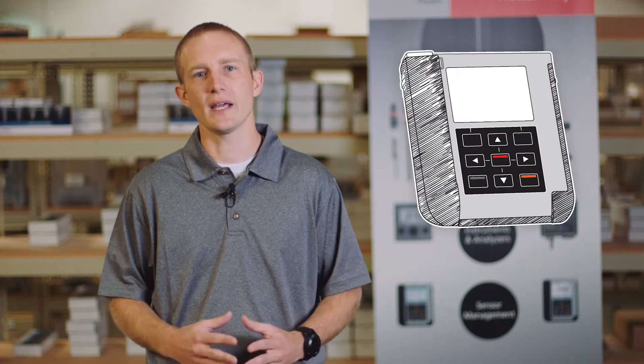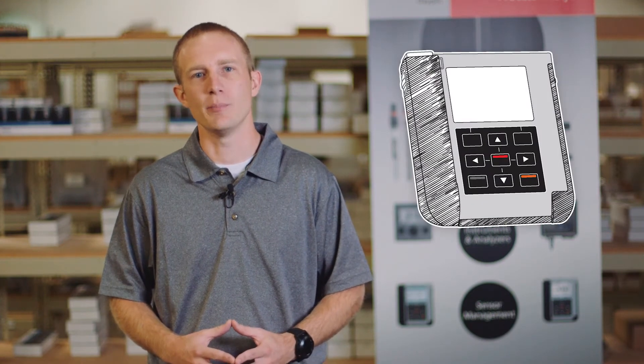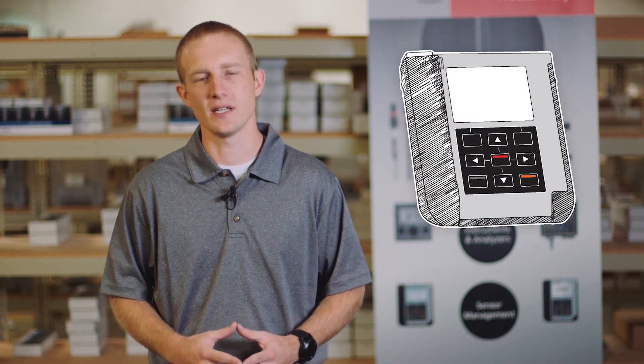Hi, I'm Tony, and today I'm going to show you how to perform an offline pH calibration using the Knick Portavo 907 Multi Portable Meter with MemoSense Sensors.